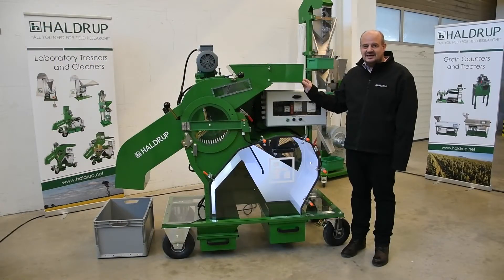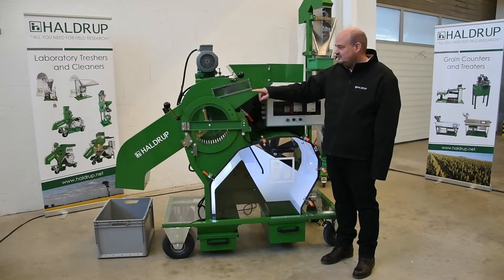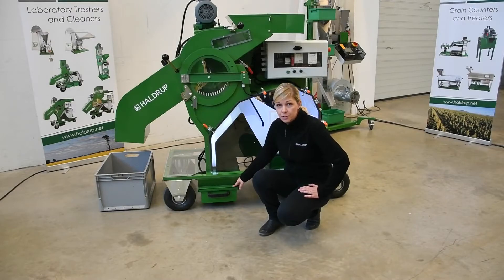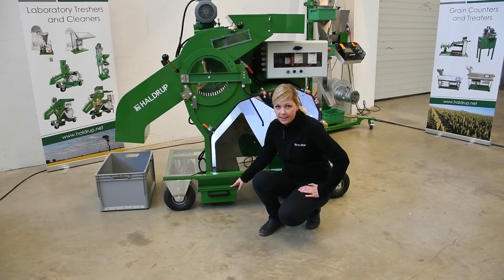Our lead thresher LT35 went through the biggest design changes in 2019 and 2020. One of these changes is the inspection window to see the material input. Another big change is the box holders which prevent seed losses because they completely close the area above the box, so even the round sieves cannot jump out.